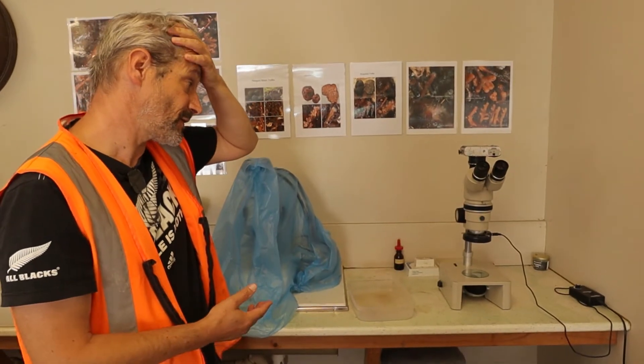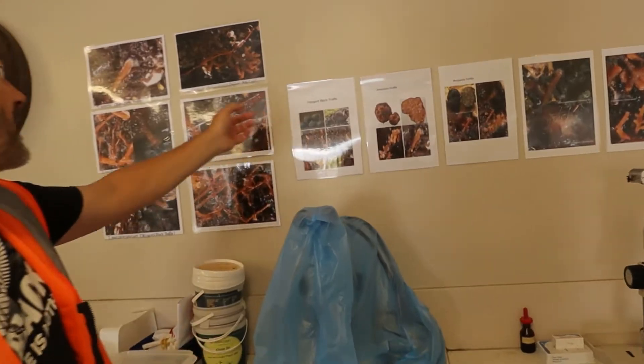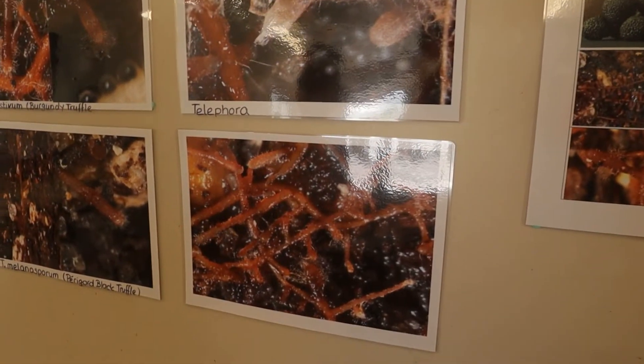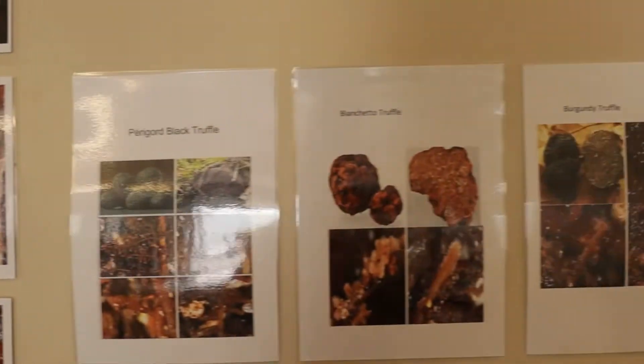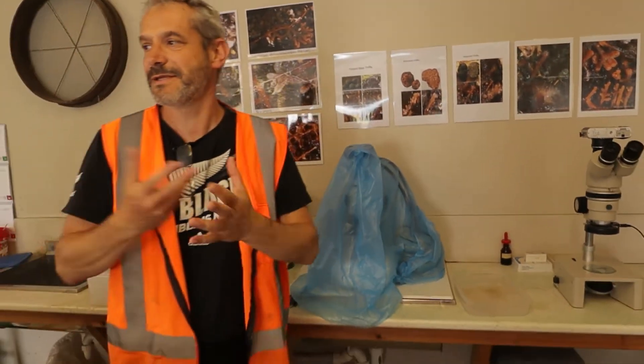The first one is a dissecting microscope, or a stereo microscope, which goes up to about 40 times magnification. This allows you to look at all the roots of the root ball and detect the presence of mycorrhizae. Someone like me can already distinguish whether a root is just a root or if it's been colonized by the fungi, because they have special signs — we call them a mantle, a fungal mantle around the roots. It's swollen. I could look for the mycorrhizae and tell you whether I find them or not.